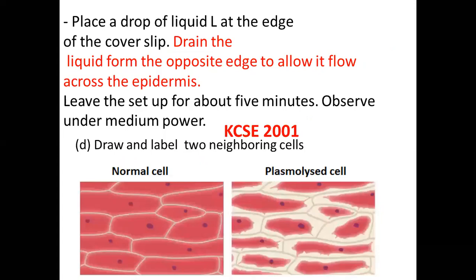Sure, I wanted to ask, when a student is doing the specimen, what you're seeing in the microscope, do you shade it? No, we don't shade drawings. In fact, in one of these conferences, we are going to talk about how to draw in biology diagrams. We don't shade. Even if whatever you're drawing is colorful, you don't shade. You just draw what you call outlines.